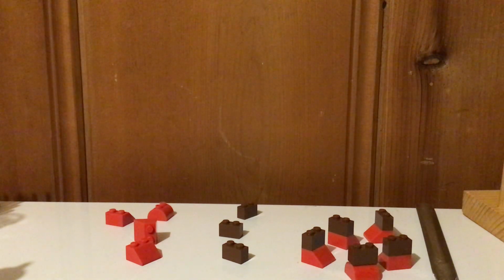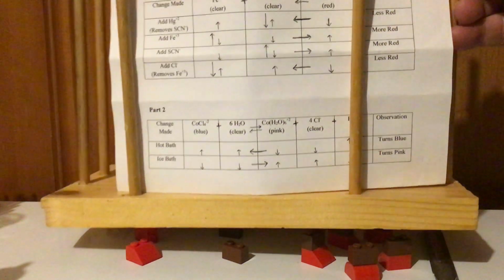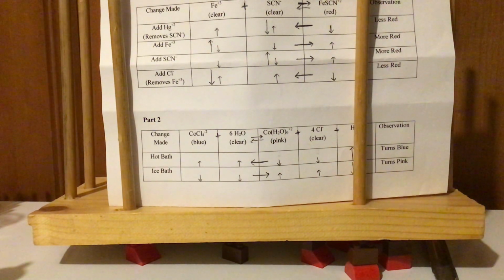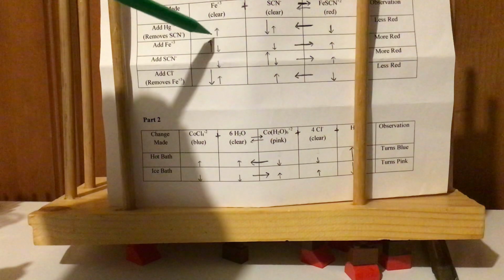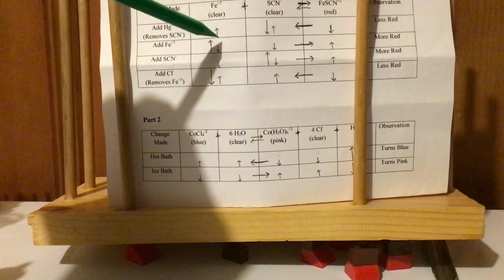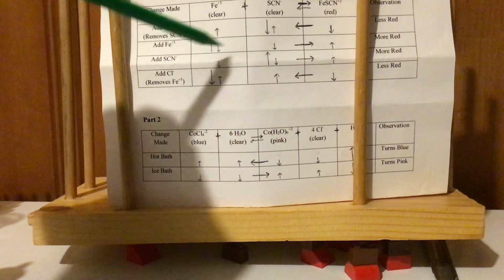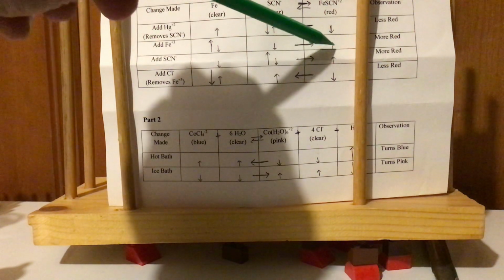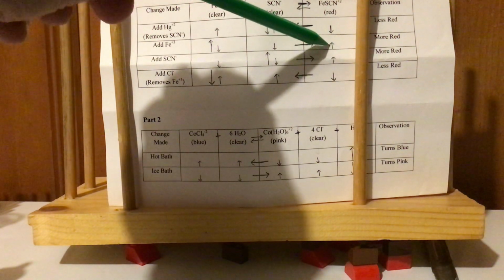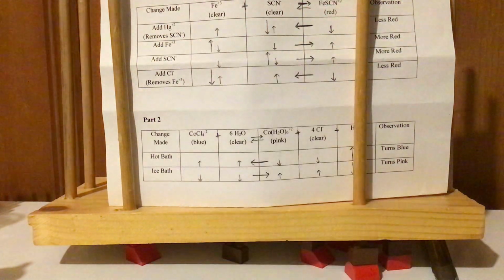So if I go back and look at this system that I have here with this chart, we can see that if I add Fe plus 3, it goes up initially. But some of that I added is taken away. What happens is some of the Fe plus 3 that I had will react with SCN minus, making that decrease, forming more FeSCN plus 2, or the combined Legos in this case. The FeSCN plus 2 is the thing that's red, so it's going to make it more red.